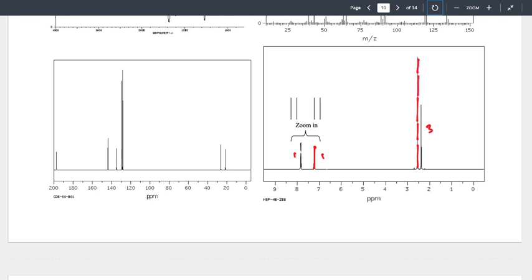Right? What's the difference? Because if we go through and actually look at what the screen showed, those were 2s and those were 3s. Are those the same height? No. Why are they both integrating to the same thing?